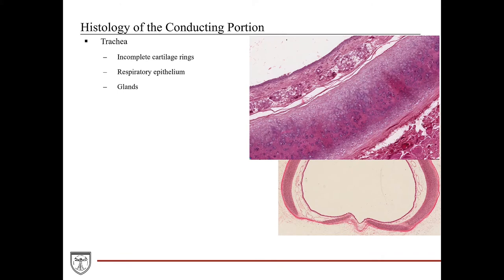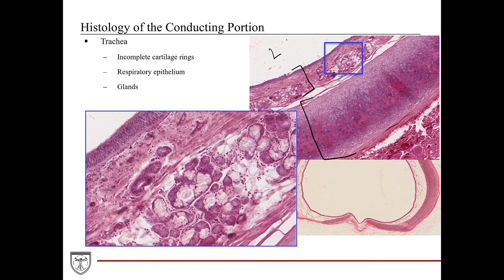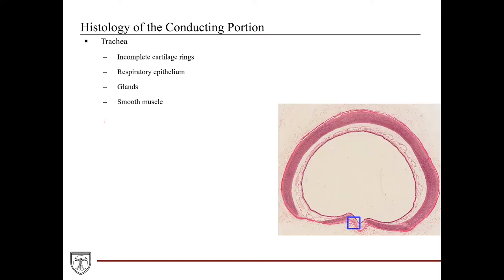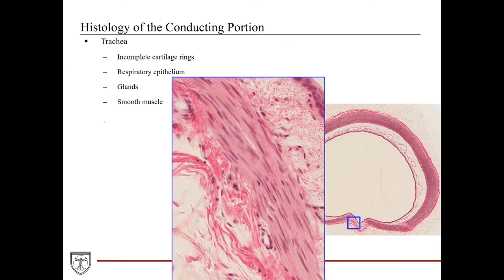Here's a different region of the trachea showing the hyaline cartilage, lumen, and mucosa. At higher magnification we can appreciate the respiratory epithelium lining the lumen, and the lamina propria with ducts leading into glands. These glands are made up of pale-staining mucus-secreting regions and more basophilic serous-secreting regions — all mixed glands secreting seromucous secretions into the lumen. This keeps the luminal lining moist, allowing cilia to beat and sweep debris upward toward the pharynx. The posterior aspect of the trachea is comprised of smooth muscles, visible as bundles at higher magnification.